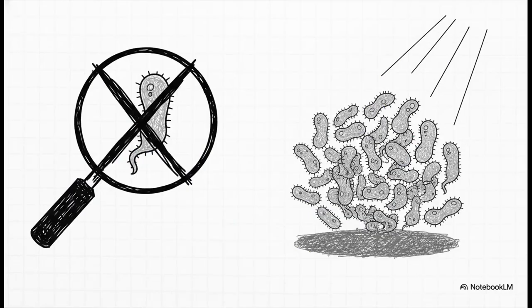And here it is. This is the secret, the big aha moment. You stop trying to count the individuals. Instead, you measure their collective impact. You see, as that yeast population gets bigger and bigger, they literally cast a kind of shadow in the liquid, making it cloudier. And that cloudiness, that's our key.